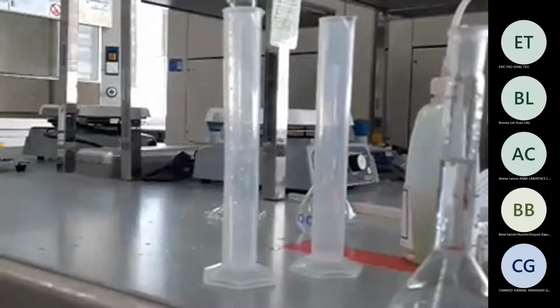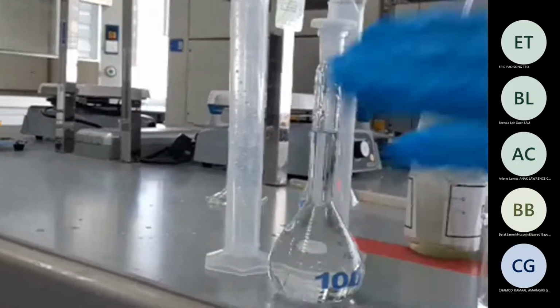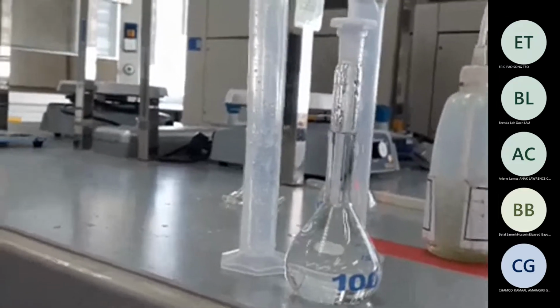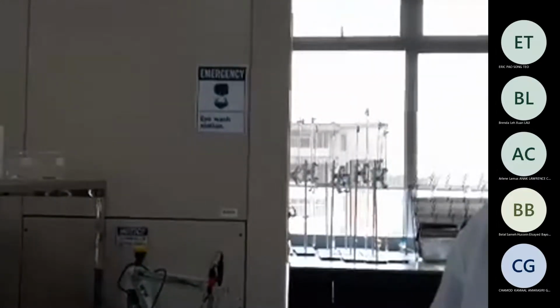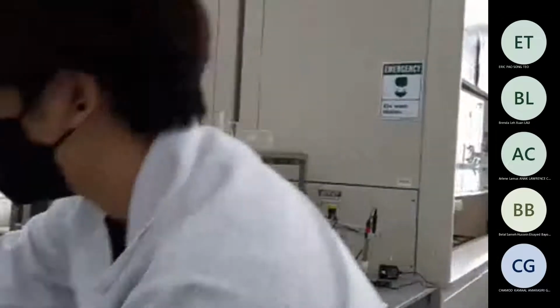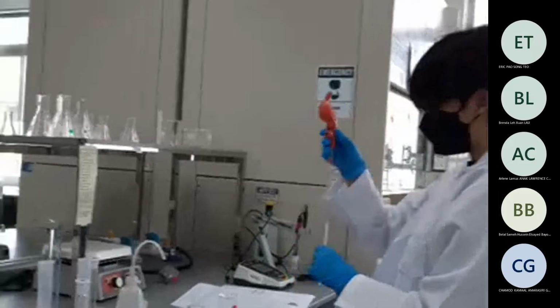So you need to do the same thing for ethanoic acid, right? This CH3COOH. So if I already washed that with distilled water, then. Have you already? Yeah. Okay. So one last thing that you need to do is invert it a few times, to make sure that it mixes well, everything. Yep. So take 10 milliliter, and then the same way you have to dilute it.